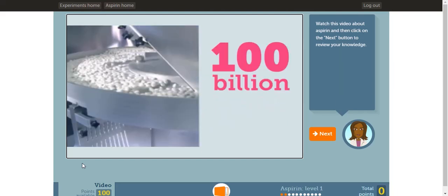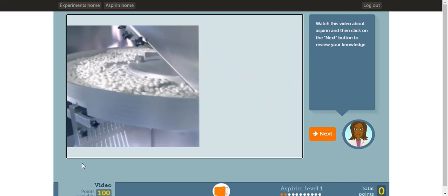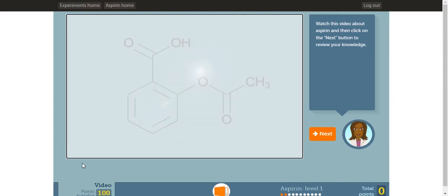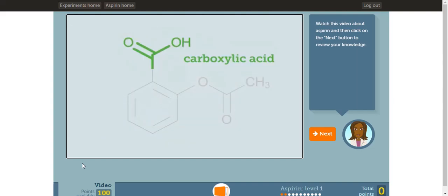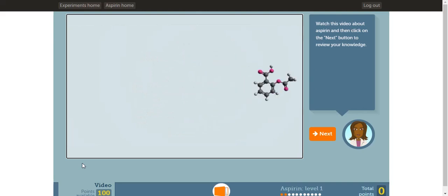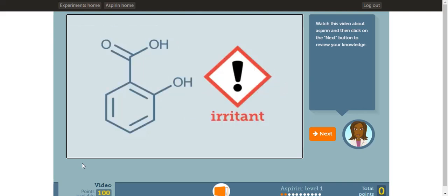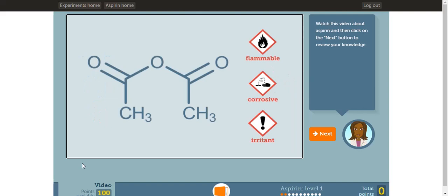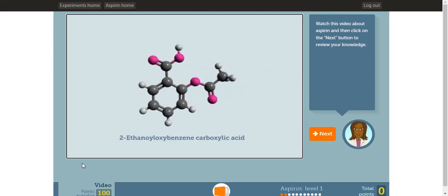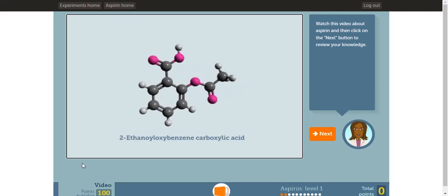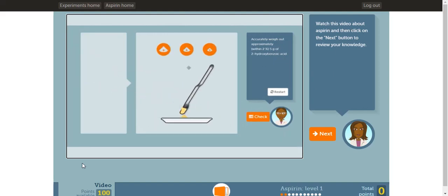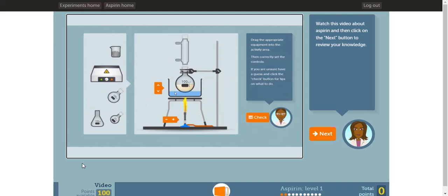That's a hundred billion tablets every year. They're used not only as a painkiller, but also to treat fever, inflammation, rheumatism and heart disease. Aspirin contains a carboxylic acid group, an ester group and a phenyl group. Aspirin is created using a compound called 2-hydroxybenzoic acid by esterification with ethanoic anhydride under acid-catalyzed conditions. The chemical name for aspirin is 2-ethanoyl-oxybenzene carboxylic acid. In this activity, you'll learn how to synthesize aspirin. You'll get to set up and run your own experiments and work out how much aspirin you produced.